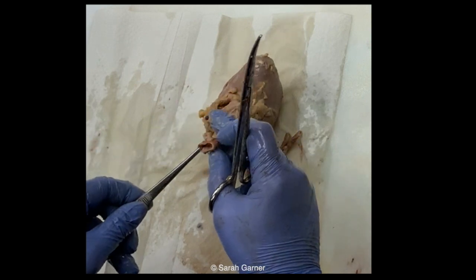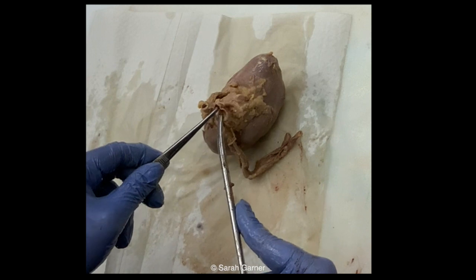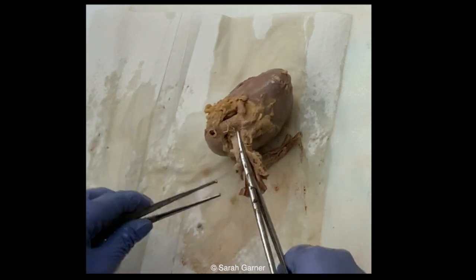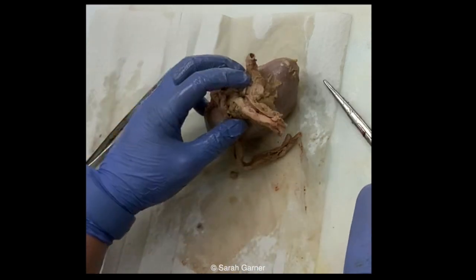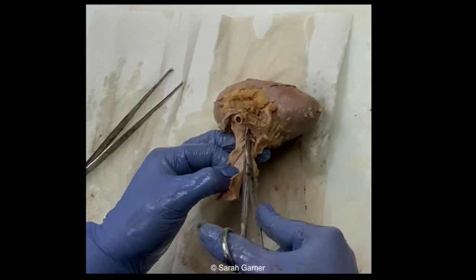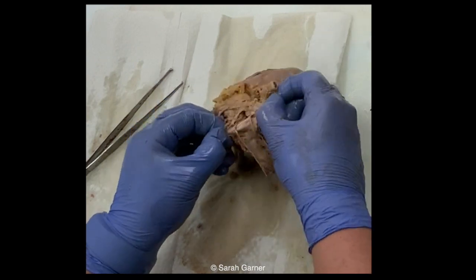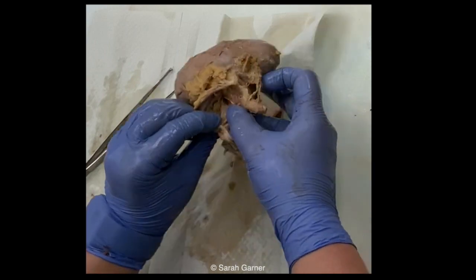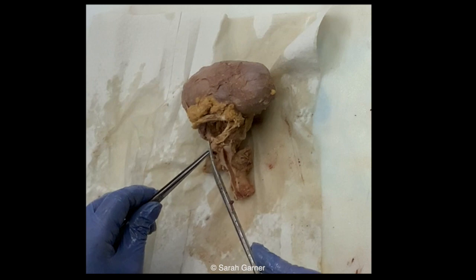it's not necessary. So this is our renal vein, right? Thin wall, larger lumen, most anterior. So we'll go ahead and we'll open this up. I was holding that renal artery out of the way. Okay, so we look at the inside. We don't see anything abnormal. You can peek in here, same thing, nothing abnormal. The inside looks totally fine. You can do the same thing with the artery.